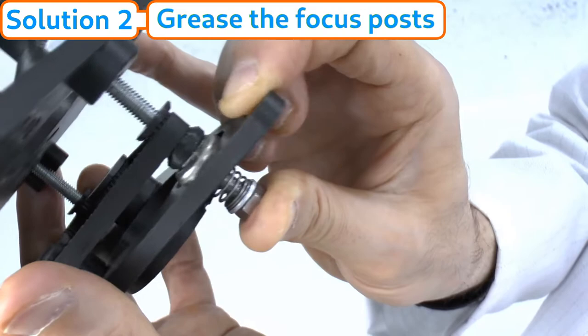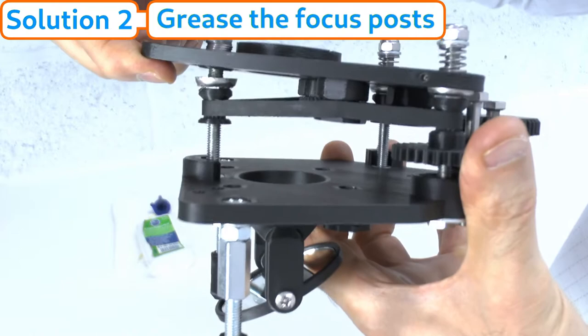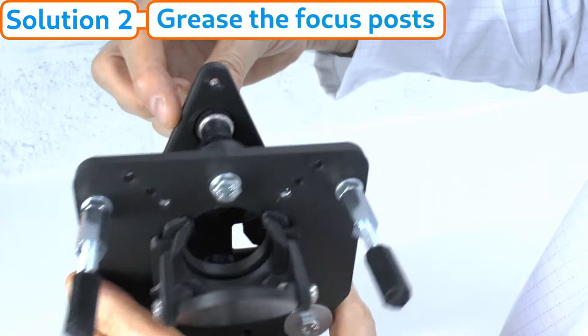Now the important thing: when you release the spring, make sure the loose washer is central in its little cavity. If it isn't, just hold it the right way up and move it a couple of times until it settles in its groove.